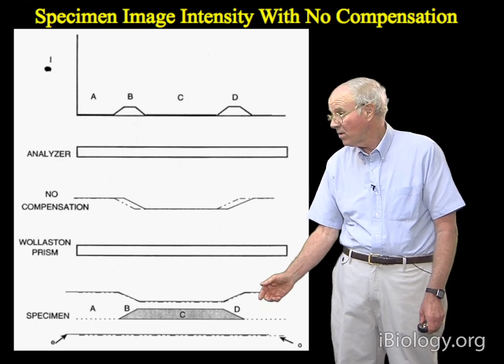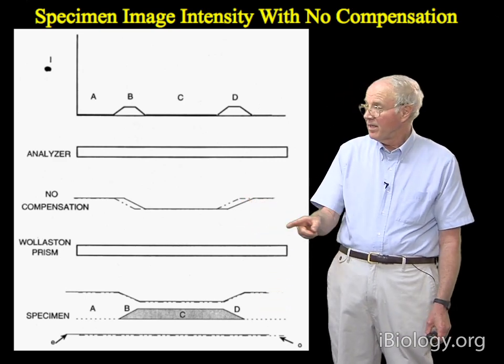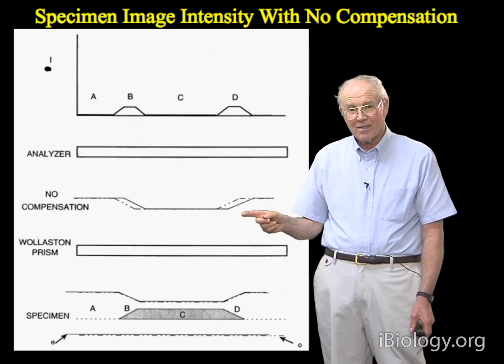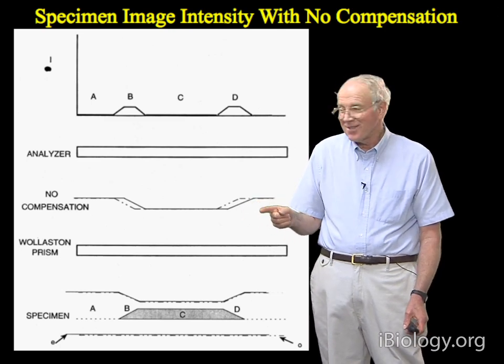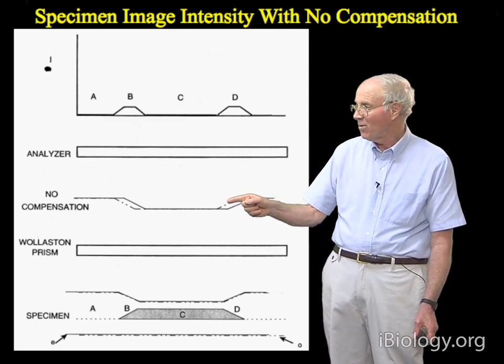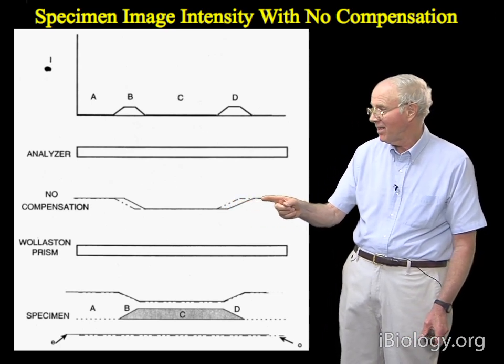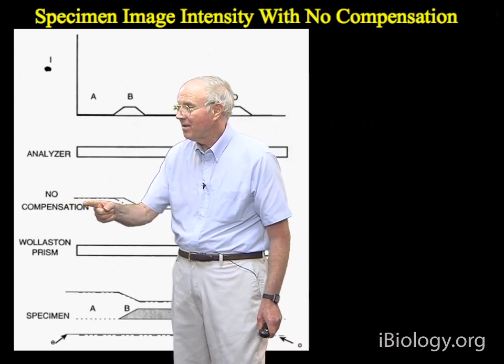And you can see the O is shifted to the left, and the E is shifted to the right. And for me, shifting to the left is not easy to do, so I'm not going to do it. But you can see by looking at the endpoints of these lines right there that they're now lined up here, and over here, they're now lined up.